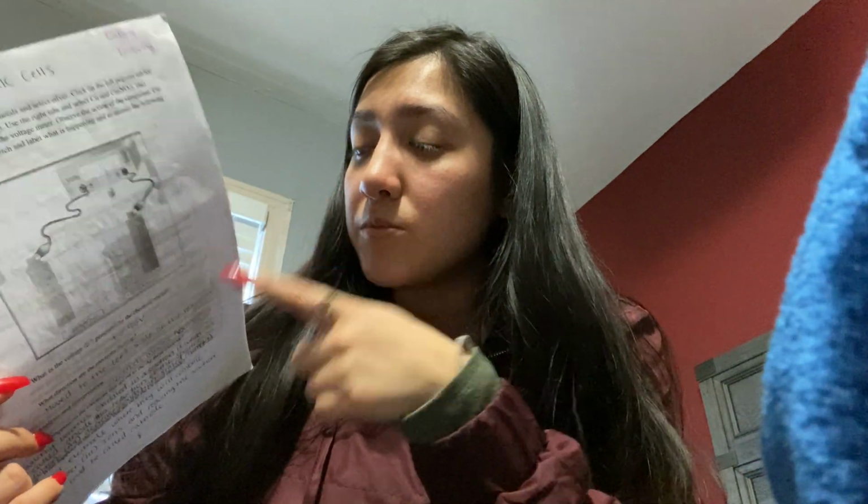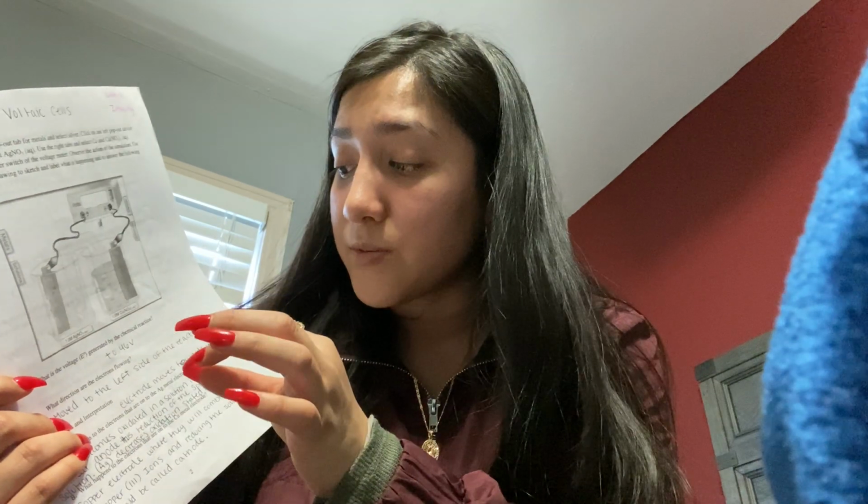So what it did was, in the website, it had a solution where a beaker and another beaker were connected by this voltage simulation, and had a specific metal in each one. In this metal, it would determine if it would go into the left beaker or the right beaker, depending on how strong the ions were. But I think it mostly went to the left, and hardly any to the right.